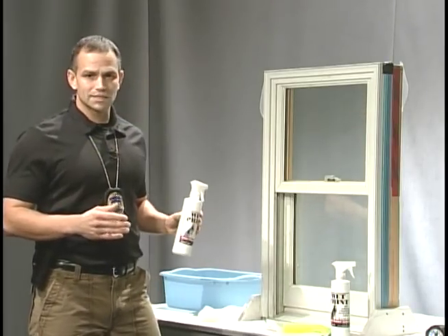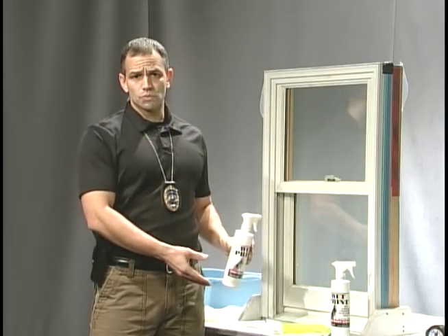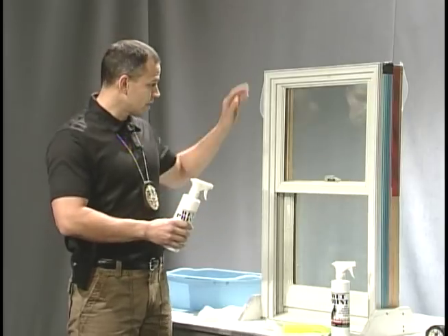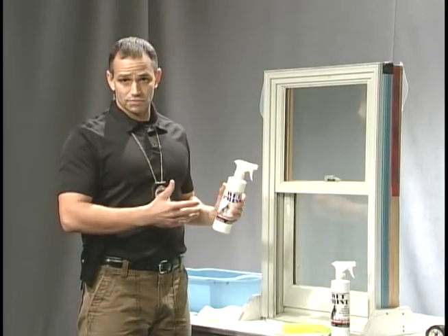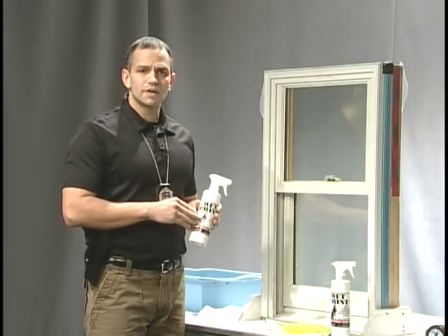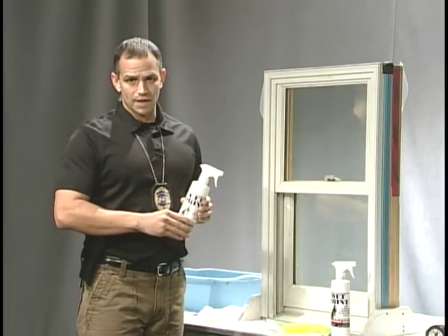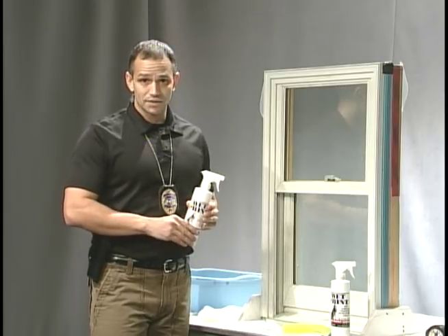This is fantastic if you're on a scene and you have a product that is submerged in water, or a stolen car that's out in the rain. Today we're going to use a window — you can pretend that this window was outside in the rain and you still want to develop your fingerprints. Not only are we going to develop fingerprints that are wet, we're going to lift fingerprints that are wet. There's no need to wait for them to dry, and I'm going to show you a technique to do that.